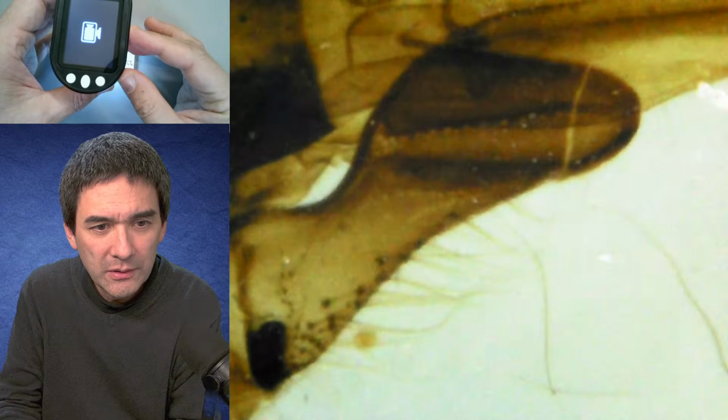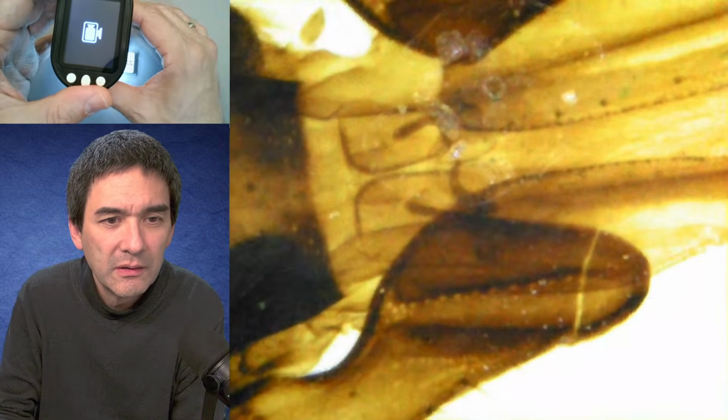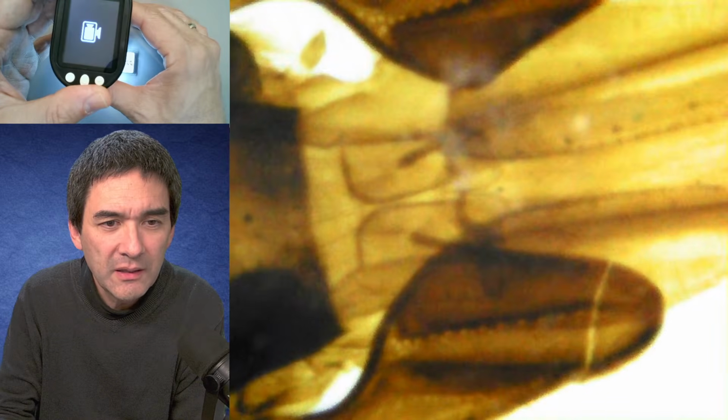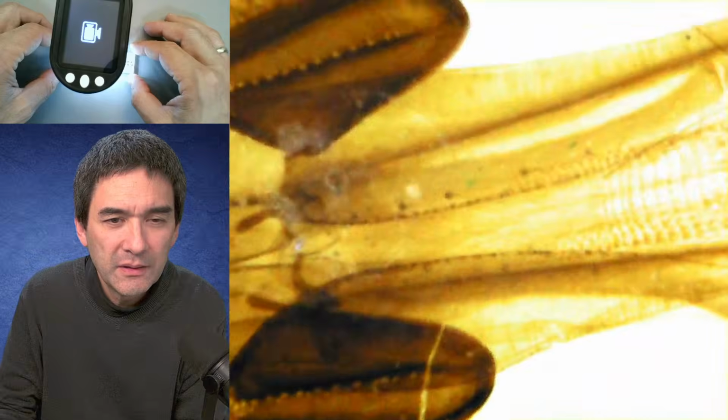Now it's too dark. So what I have to do is, on the side here, I can adjust the light intensity. I have to turn it up a little bit more. Okay. And that is now basically at the higher magnification. Okay, so this is the interesting thing.